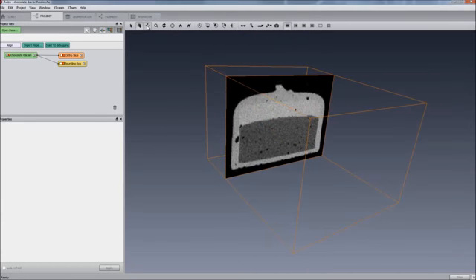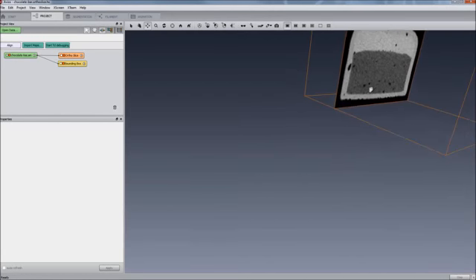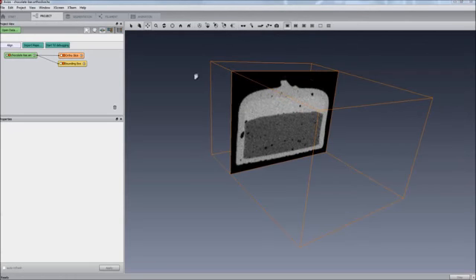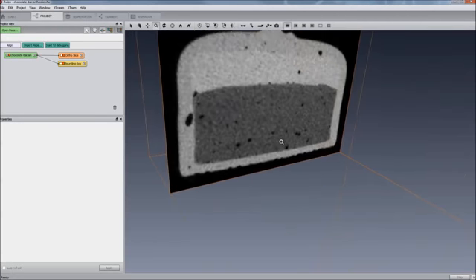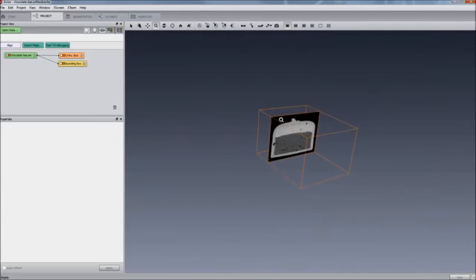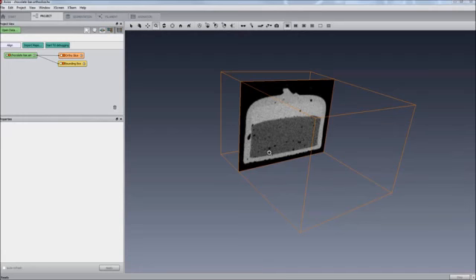The third button selects the Translate viewing mode, in which a left button click and drag will pan the object. The Magnifying Glass button selects the Zoom viewing mode, in which a left button click and drag will zoom in and out. The mouse behavior we will use the most is the trackball viewing mode, where the mouse cursor looks like a hand. The next button rotates the view clockwise by 1 degree.